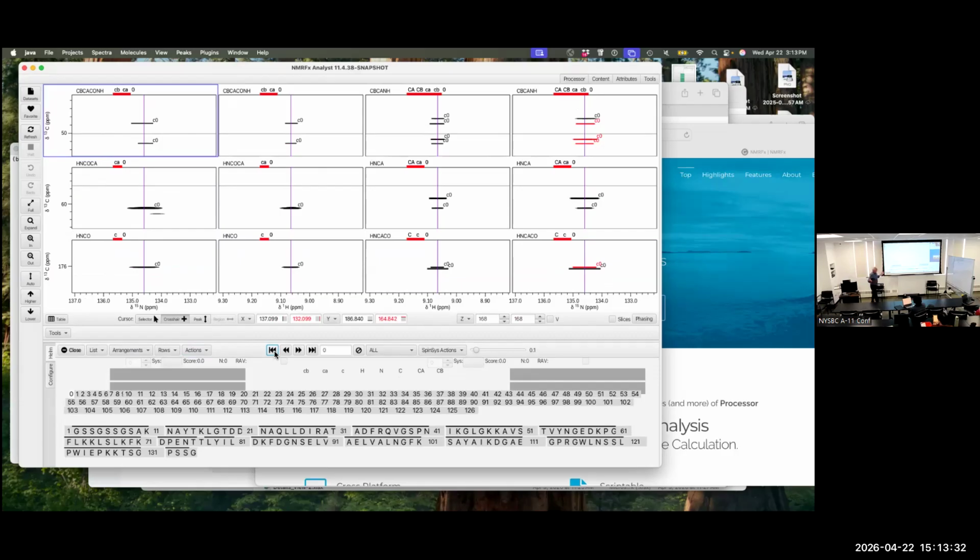Assemble basically finds peaks that share similar proton and nitrogen frequencies based on those columns. Then it links them together into spin systems. So now instead of seeing a peak number, we see a cluster number, a spin system. So all the peaks that are 0 have been linked together, presumably all coming from the same residue, sharing an amide frequency of the same amino acid. Okay.